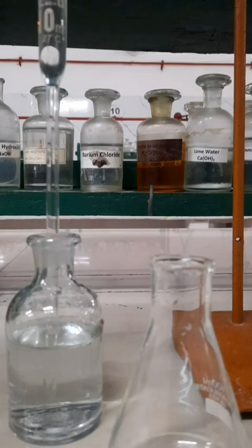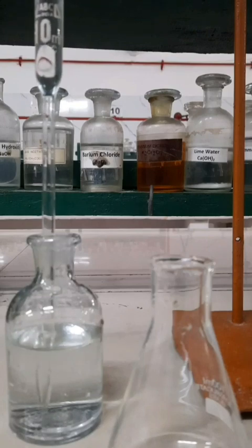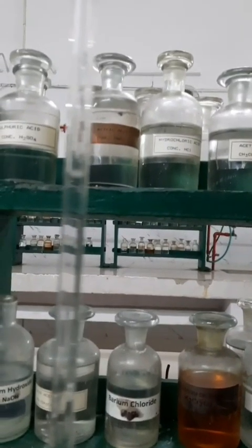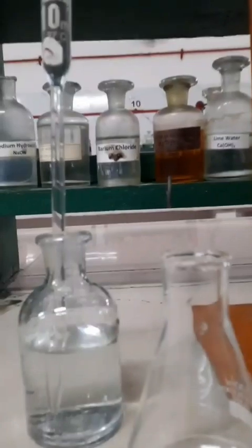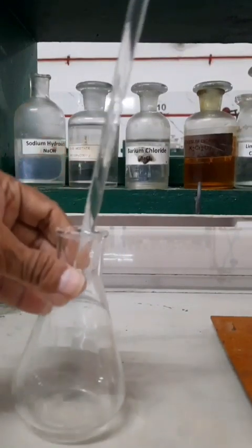Now you have to fill the pipette up to the mark indicated on the pipette and adjust the lower meniscus of the solution up to the scratch mark indicated on the pipette. Here I am adjusting the lower meniscus of the liquid. Since it is a colorless solution, the lower meniscus will coincide with the scratch mark indicated on the pipette. Then you have to remove the pipette and transfer the solution into the conical flask.